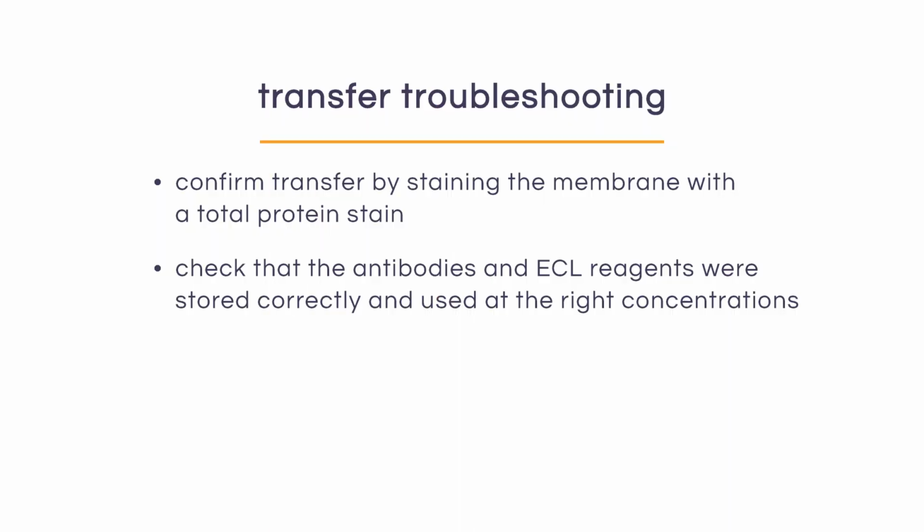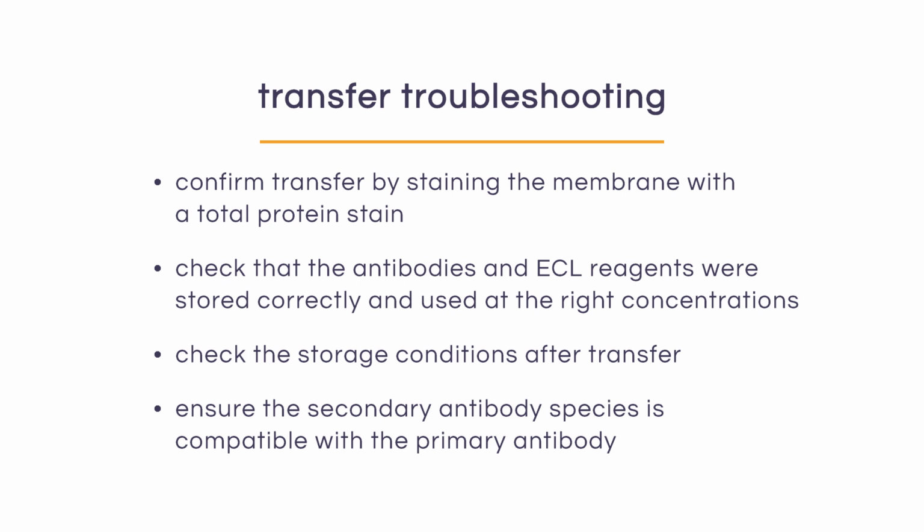If the transfer was successful, check that the antibodies and ECL reagents were stored correctly and used at the right concentrations. Also, check the storage conditions of the blots after transfer and that the secondary antibody is the proper species to ensure that it will bind to the primary.